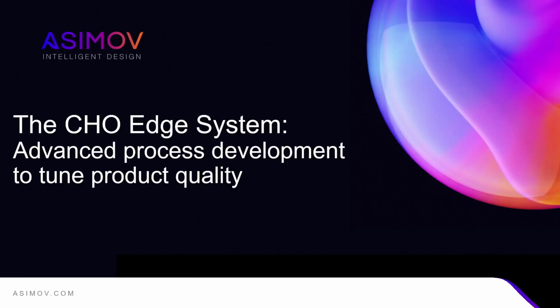What if we could start from the beginning and design these vectors in a more predictive way than we're currently doing, so that we can understand how they'll perform from the initial design all the way to process development?